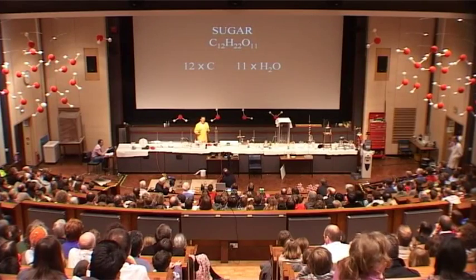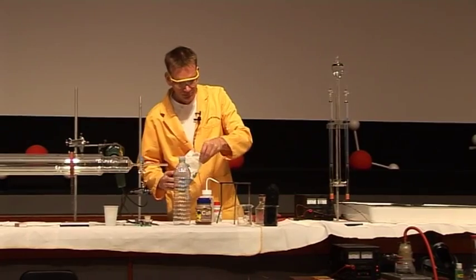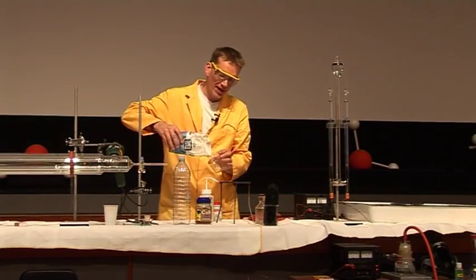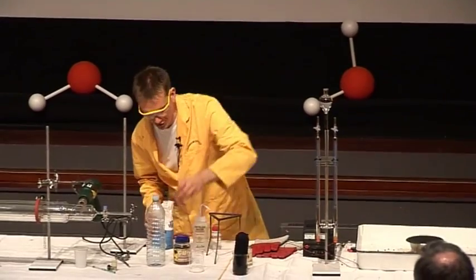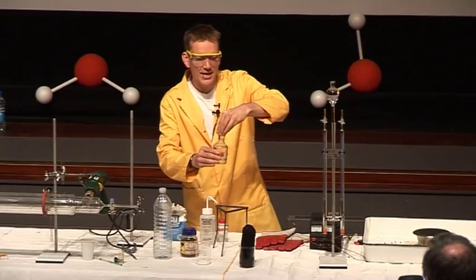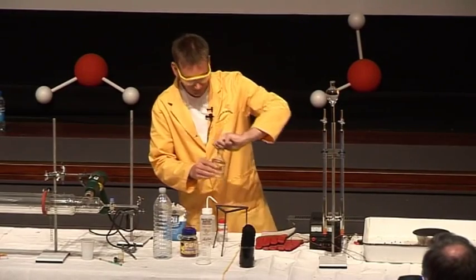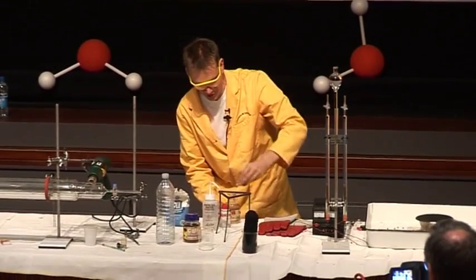We can actually remove the elements of water from the sugar in a reaction using something that has a very strong affinity for water, and that's concentrated sulphuric acid. I have some acid here, and I'm going to add the acid to the sugar.